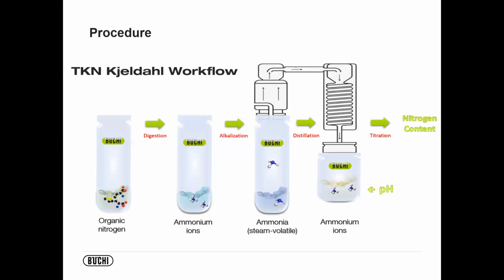So within the procedure, this is your common TKN workflow. I'm sure we're all familiar.